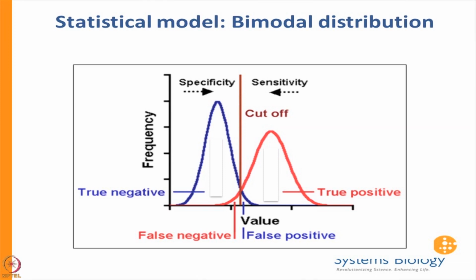You take all these measurements and you don't try to threshold, you don't try to decide what's good, you don't try to take Excel and pick a cutoff. What you do is you make some sort of statistical model and you try to separate the true positives from the negatives.